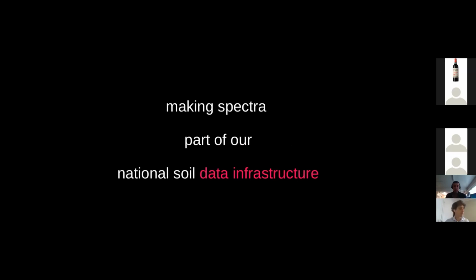I'll just finish with data-related questions. As you've seen, we've rolled out quite a few papers over the years about those technologies. What we found is that our next challenge is to make those spectra actionable by all sorts of researchers in our institutes. So it's a pretty pragmatic view of these tools: how do we make spectroscopy operational? It's one thing to build models, but to build a pipeline of models that can be automated, for example, is a large task. So what I show now is how we interact with our database.